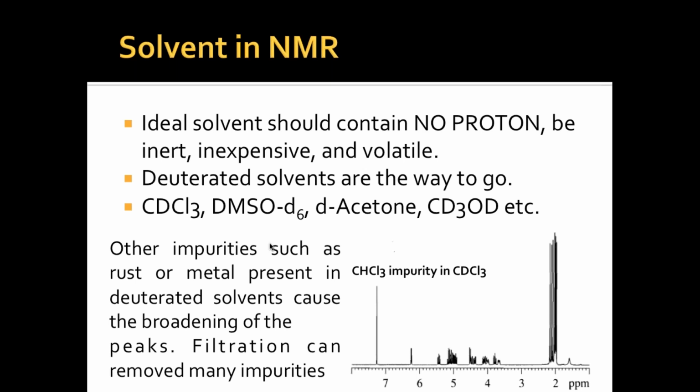So remember, one thing I should tell: we have to dissolve our sample in some solvent. Now, what solvent? That solvent should not have proton. That solvent should not react with your compound.